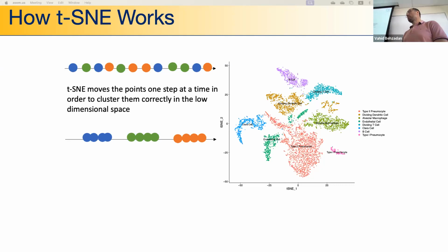I don't know. But I think for this kind of analysis, just simple Euclidean. Yeah. But I think you're right. You can do it differently by embedding the genes somehow before performing the t-SNE.